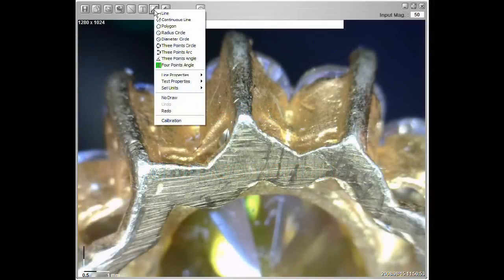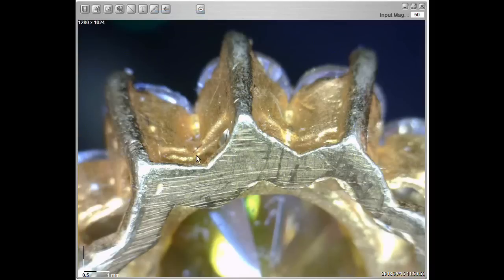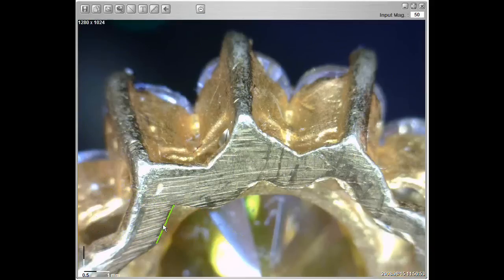Click on the measure button, then line. To start measuring, left click the mouse for the starting point, then another click for the ending point. Lastly, place the results where you want it and click again.